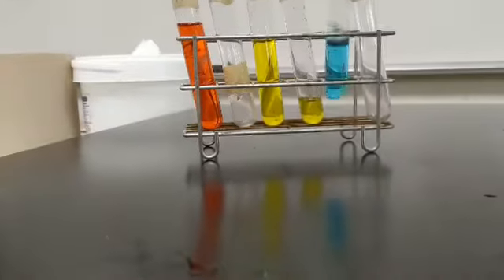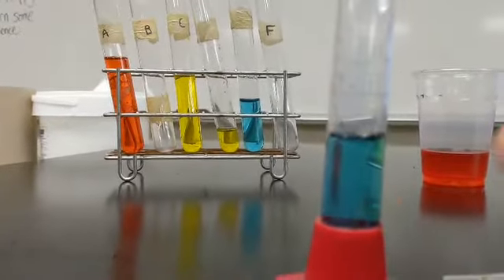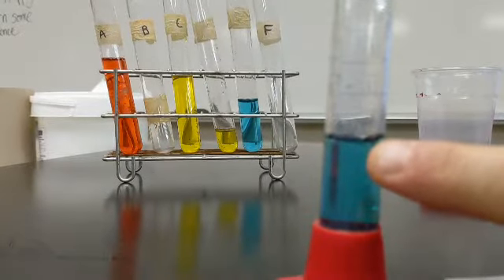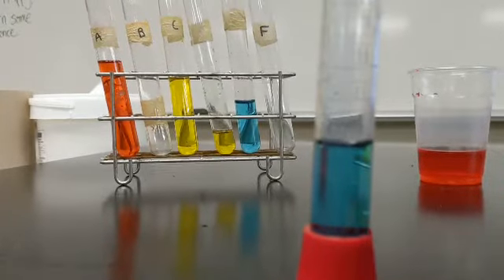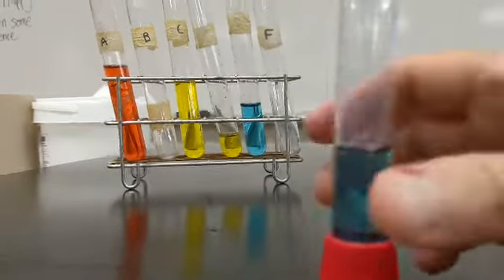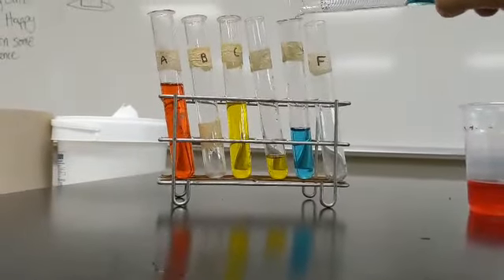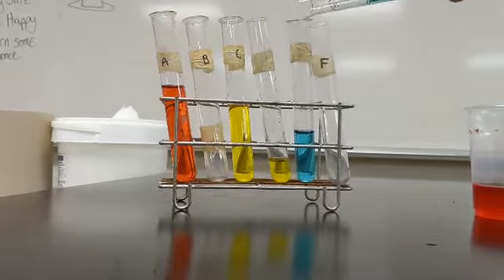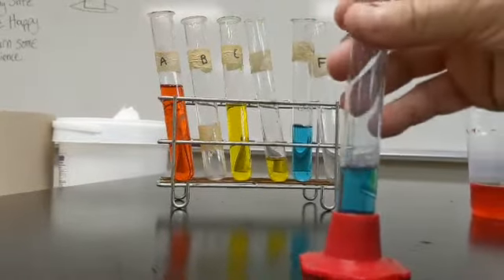Too much. I know you can't see it, it's not focusing, but the 7 is about here, so there's about a whole milliliter that I overshot. I have to take some out and the pipette won't reach, so I have to pour it. And I apologize that the video is shaky. I'm holding the camera with one hand and trying to do all this other stuff with the other hand.